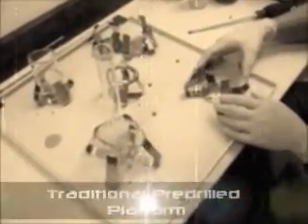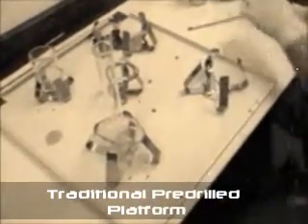Gone are the days of searching for the toolbox when changing the flask clamps on your old fashioned pre-drilled shaking platform. The tedious process of lining up a series of holes, locating the correct screw size, and tightening 4 screws per clamp is a thing of the past.